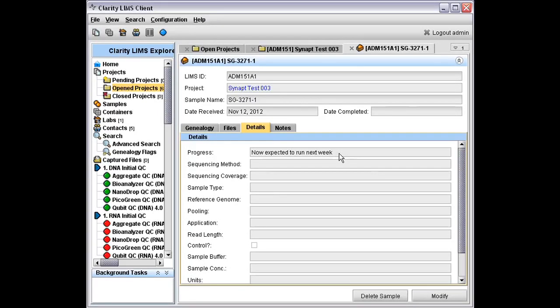So most of the time we want to be manipulating the API via a program, but if you just want to do a quick change, or you want to fix a typo very easily, you can use the operations interface, or if you want, you can use Poster. Now chances are you're just going to use the operations interface, but we did want to illustrate this. There are a few cases where actually modifying the XML via Poster is quite a useful thing, and it can be done one change at a time rather than the overhead of writing a script.